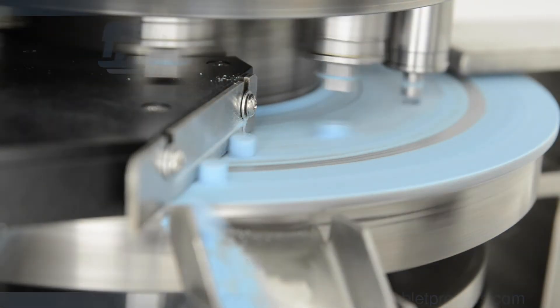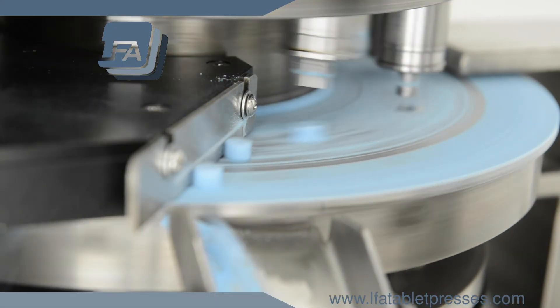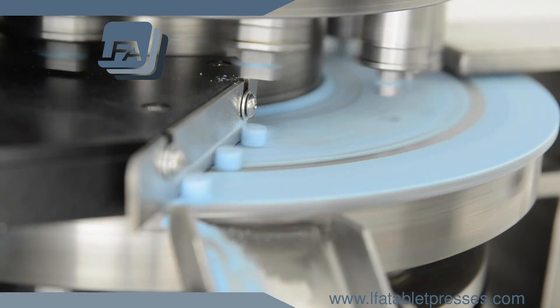For more information, products, and guides, please visit www.lfatabletpresses.com.